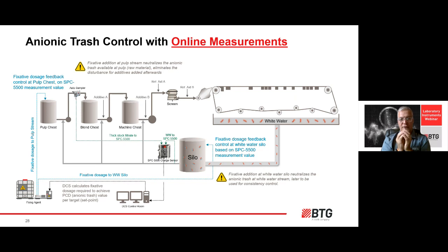A measurement in the middle of the screen there is made with a sensor, and I'll talk a little bit more about that in a second, but a sensor is taken that can sample both the white water, and, following the green line over to the left, can also take a water phase sample out of a thick stock line and look at both the water loop that's coming back as well as the water phase of the stock that's coming forward. And it can be looking for issues of things that are getting into the water that could lead to foam and deposits and other issues.